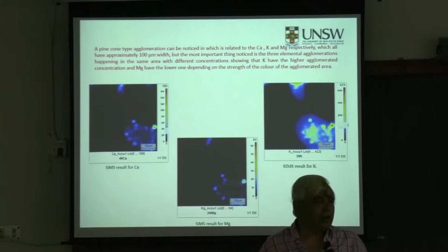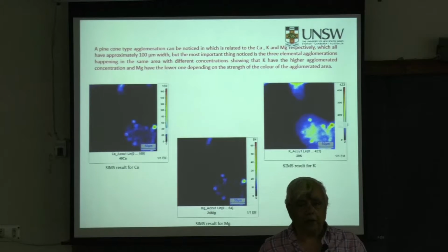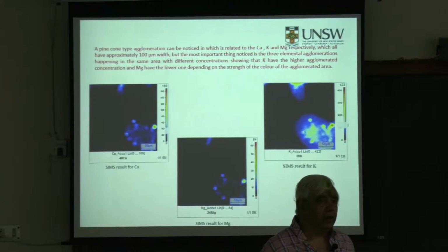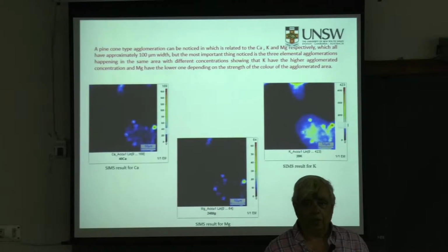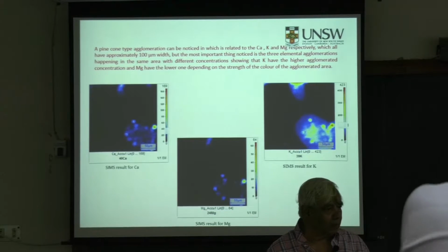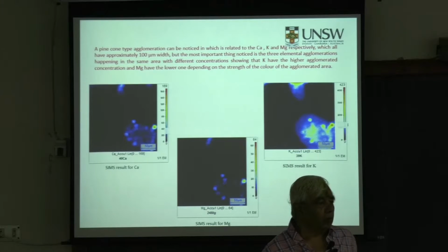There were stress-strain diagrams yesterday, so we got some good mechanical properties. But the distribution of the materials, which you cannot see properly by EDS, you can see how the local distributions are. And it's at the scanning electron microscope level. So you can put SIMS through the scanning electron microscope area, but do not give any gold coating and no polishing.